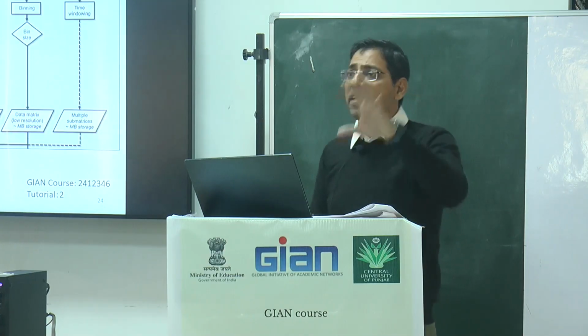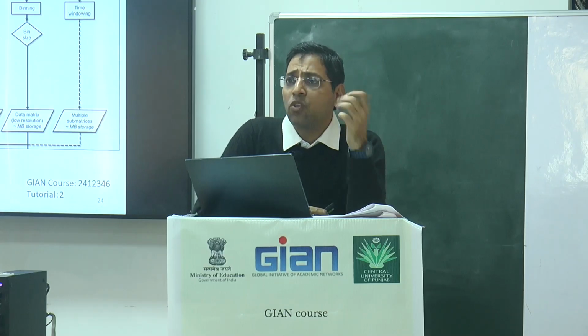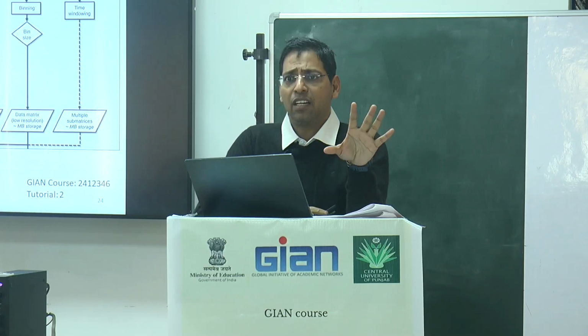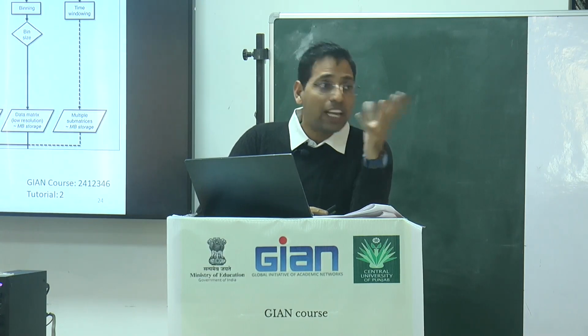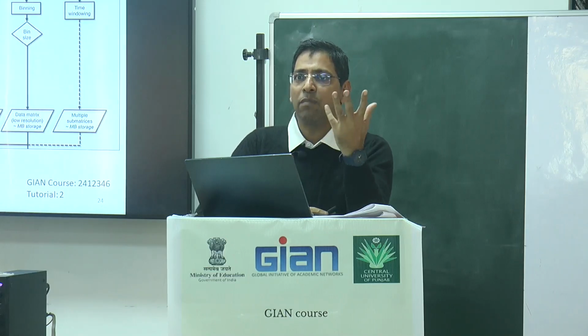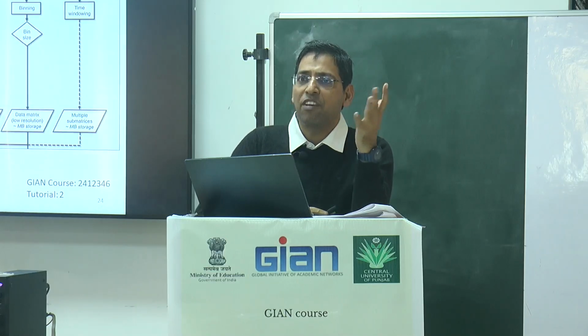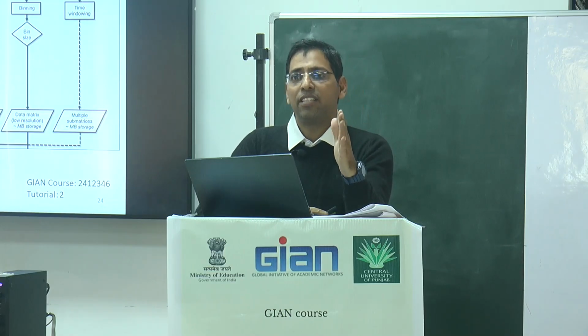So data compression is another component. Now we have so much enormous data, we can see the features, like height, facial features, skin color, only at this stage actually. Before that we are not able to identify what features they have. We have to make them user-friendly for analysis purposes.